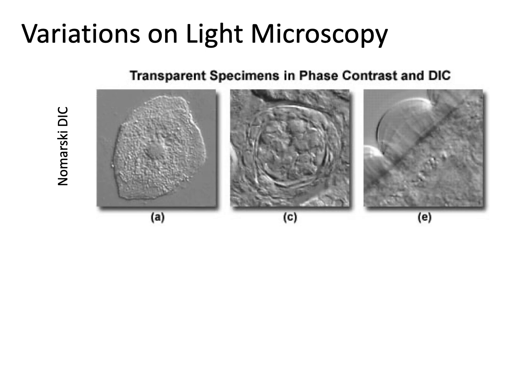And when that light is split, it experiences different parts of the sample in different densities, so it gets knocked out of phase. And when it's recombined, that influences whether it gets brighter or darker. So it's a way that we can manipulate light that provides information on the different material properties of the samples that it goes through.